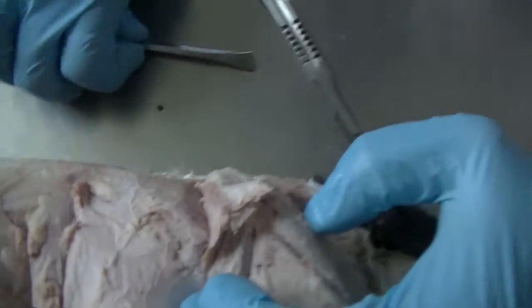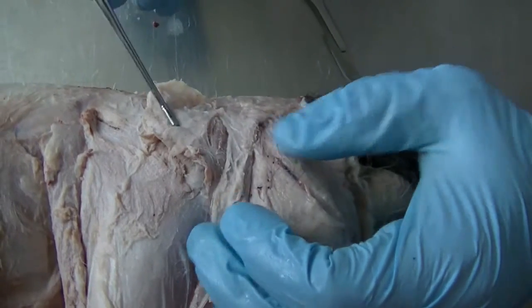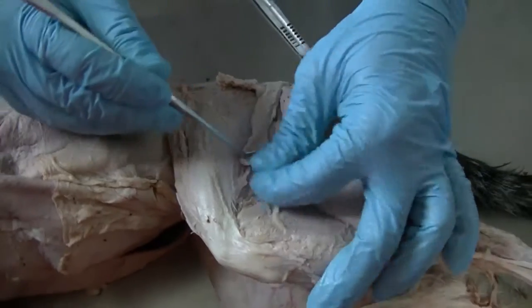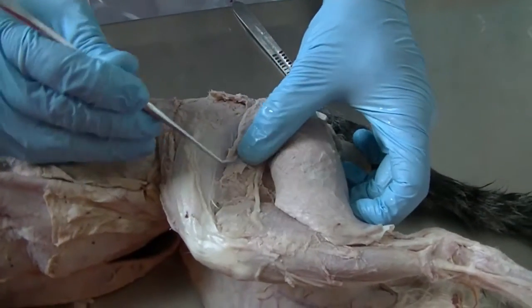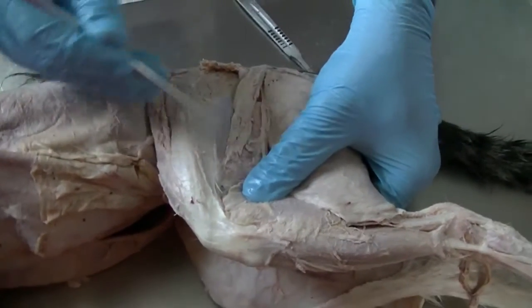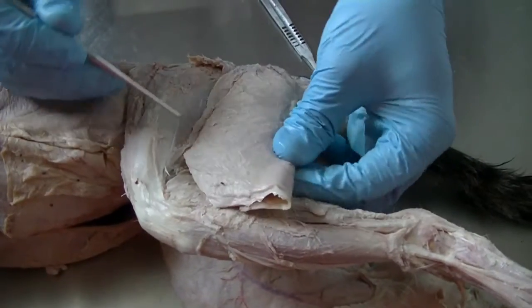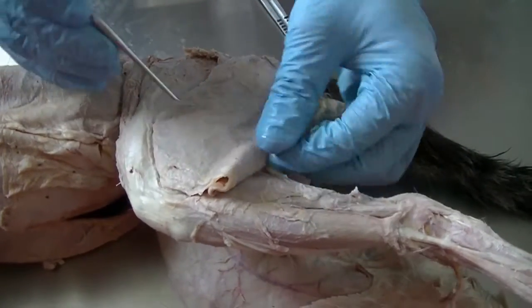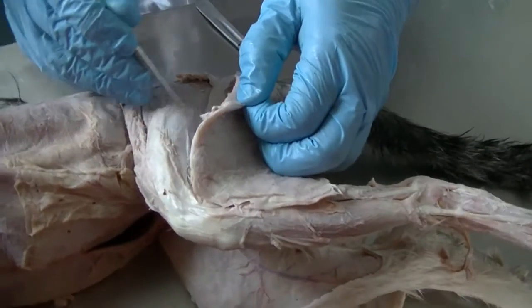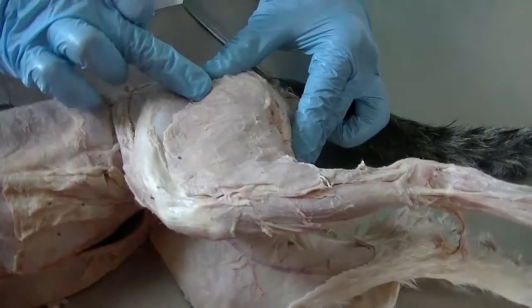The middle gluteal muscle, the superficial gluteal muscle, and the cranial crural abductor. The cranial crural abductor continues further and its aponeurosis joins the tensor fascia lata. So it then becomes part of the tensor fascia lata. So this is your cranial crural abductor, which is partially covered by the biceps femoris. As we go deeper, this muscle continues further into the fascia lata. The biceps femoris, usual structure.